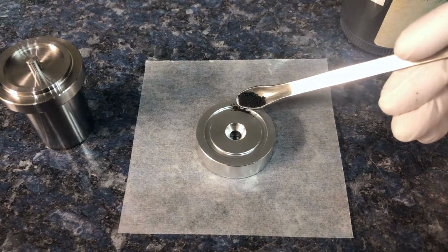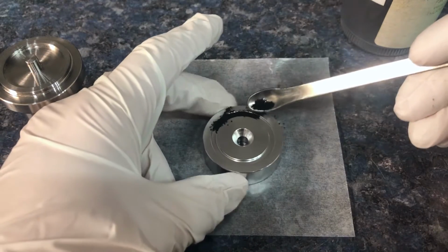In order to press a spinner disc, we start out by putting the material into the moat of the spinner disc.